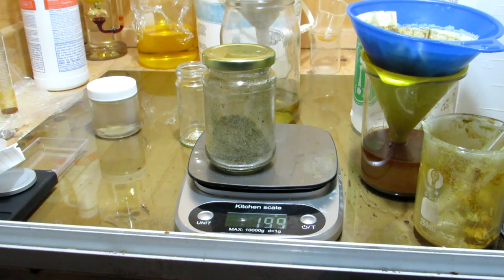The last thing I want to go over is the extreme dangers associated with white phosphorus and phosphorus pentoxide. White phosphorus is extremely toxic and can easily kill you — it's so toxic that if you ingest some it concentrates in your jawbone, your jaw can actually glow, and you will suffer multiple organ failure and die unless you have your lower jaw removed, which is not pleasant at all. Phosphorus pentoxide if breathed in can react with the water in your lungs forming phosphoric acid, causing burns. Phosphorus also burns at an extremely high temperature and would be extremely painful on skin. This is not something anyone should try — this is strictly for educational purposes.